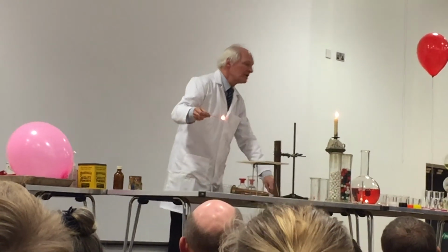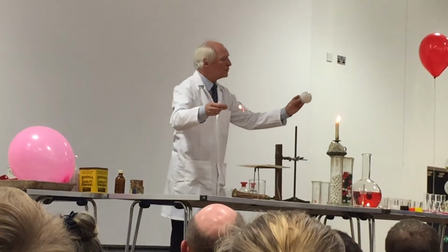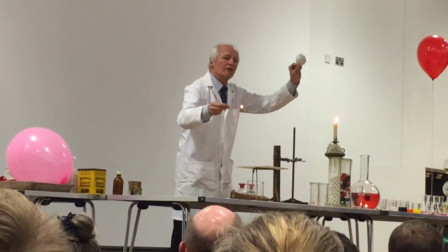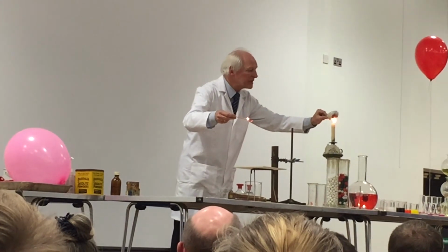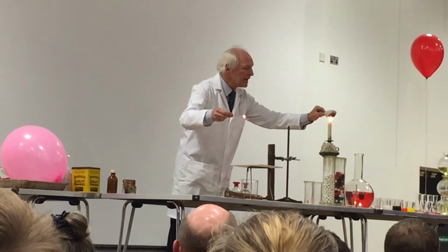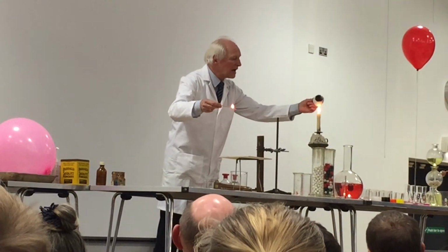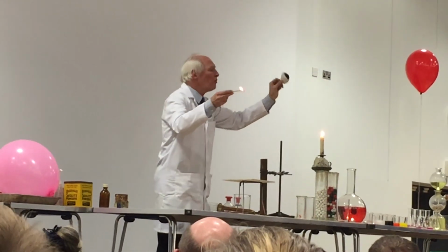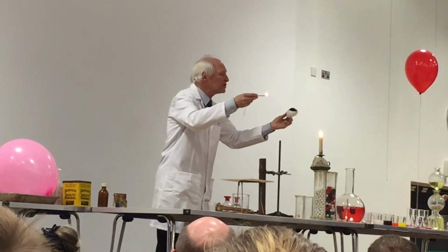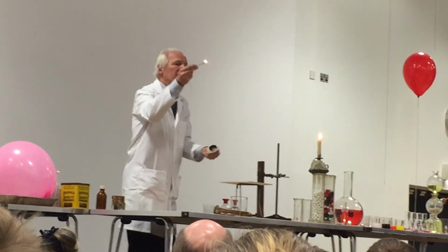And if we show even a candle flame, let me just show you. If I hold my white porcelain evaporating basin, please watch what happens as I put it over the candle flame. And you'll notice in a short space of time, a black deposit, you see. Now that black deposit is the common ingredient to all three of these fuels. It's what's found in there, in the petrol, and in there. It's what gives the smokiness.